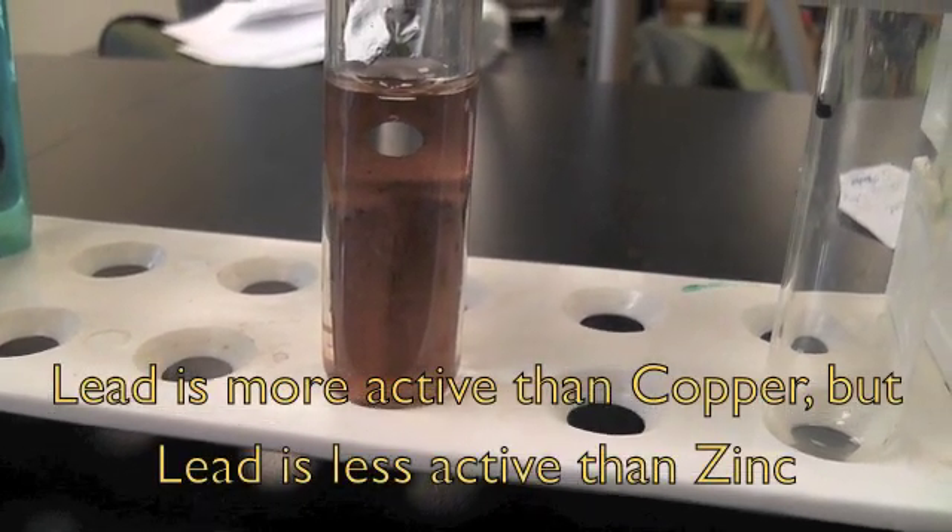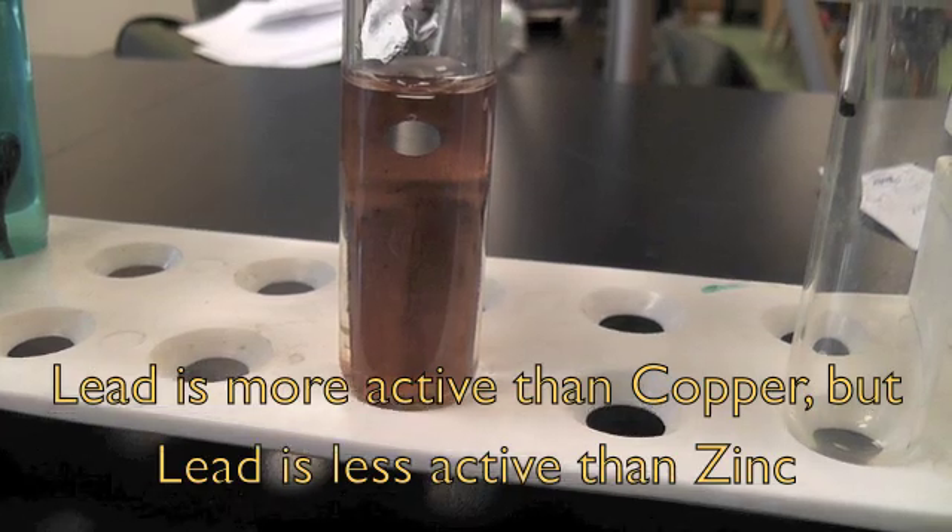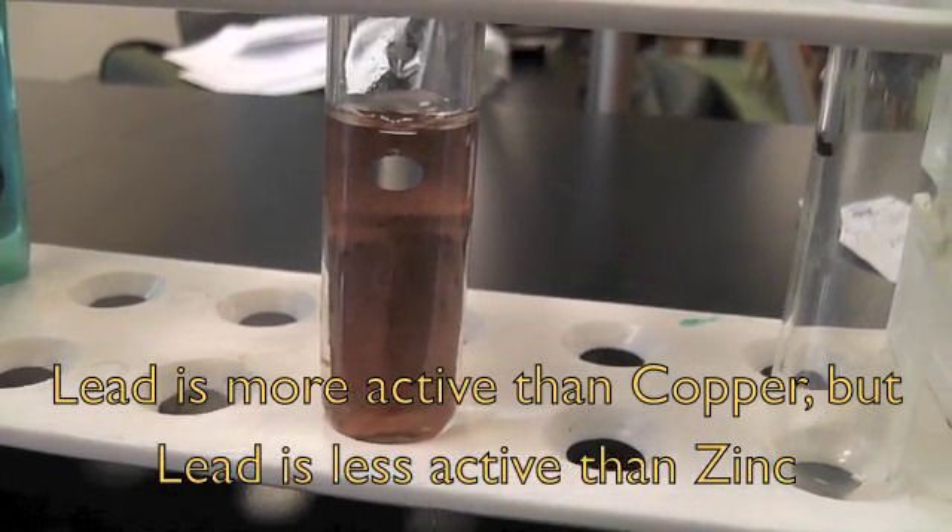Before, putting the zinc into the lead nitrate had a very observable, very acute reaction — whereas the copper showed nothing at all.